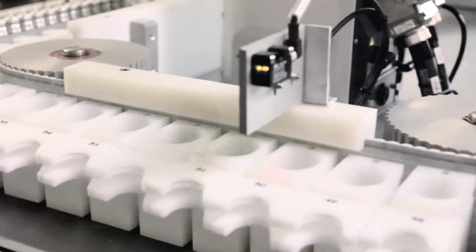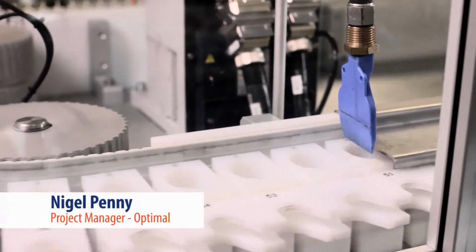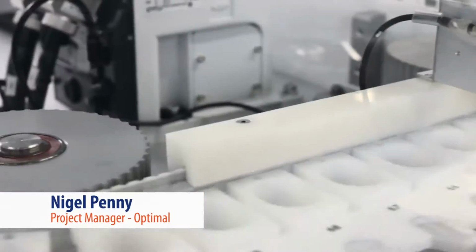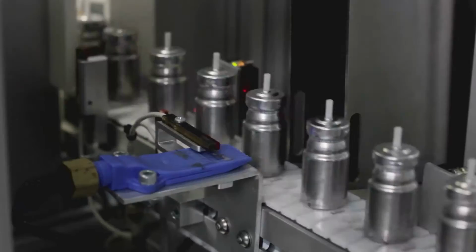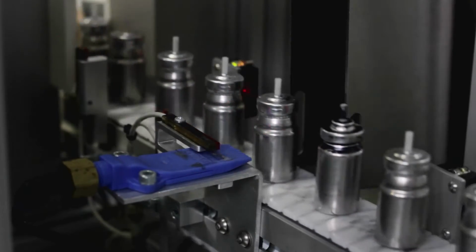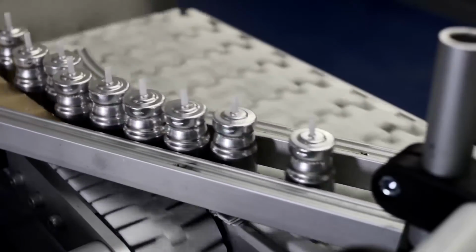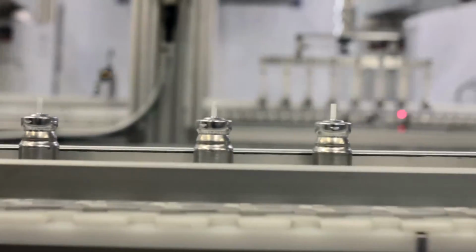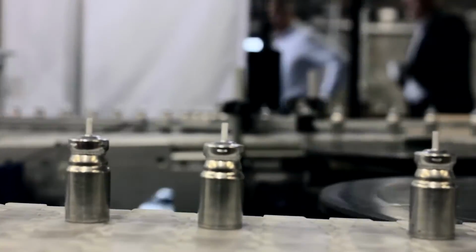Once the cans are contained within the pucks, they are transported round through a tunnel which seals the system. So we detect where the puck is, and we trigger the analyzer to take a sample. On the outfeed conveyor, there is a reject station, so only good cans leave the system. This technology allows those companies to test every single can during production, which means that we're only going to reject the can that's at fault, which means a massive saving for the pharmaceutical companies. There is a big benefit of highlighting issues with the production process upstream of the machine if there's multiple rejects.